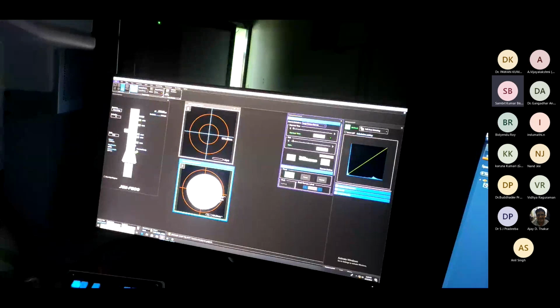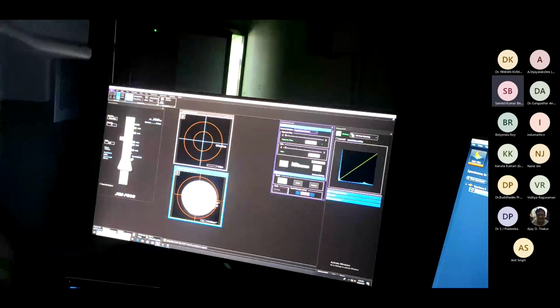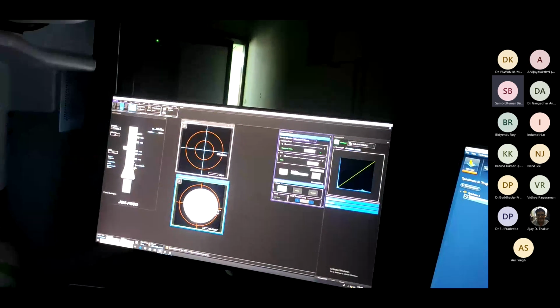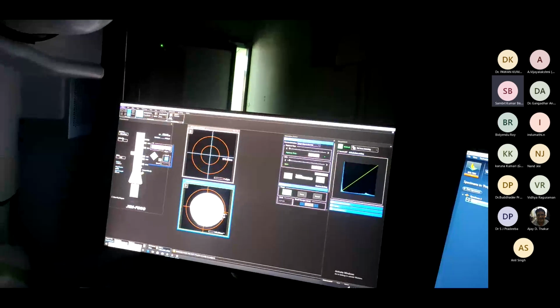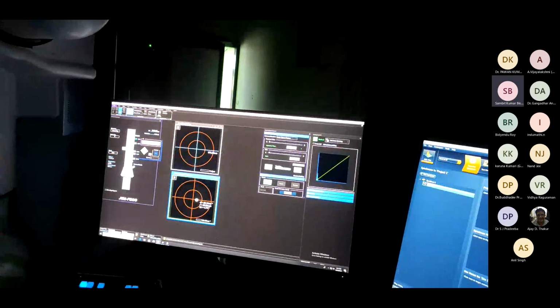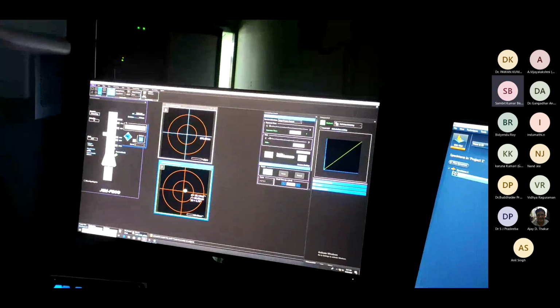Now this is at the center. We have to move to the edge of the sample, right? Yes. Here we are. Okay. Now I have to insert the CL aperture of 40 micrometer. Okay, this is shifted, so I have to bring it to the center.